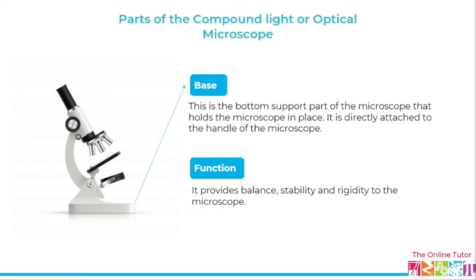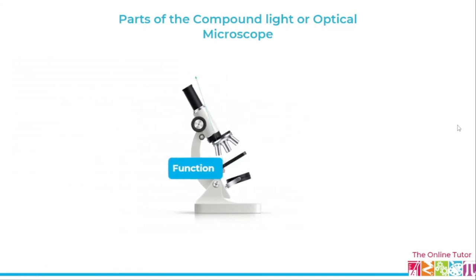So the base, just like our legs, the human legs, provides us with stability and balance. The same goes for the base of the microscope. It provides balance and stability to the microscope, so that the observer or the scientist can use the microscope without having any difficulties in using the device.